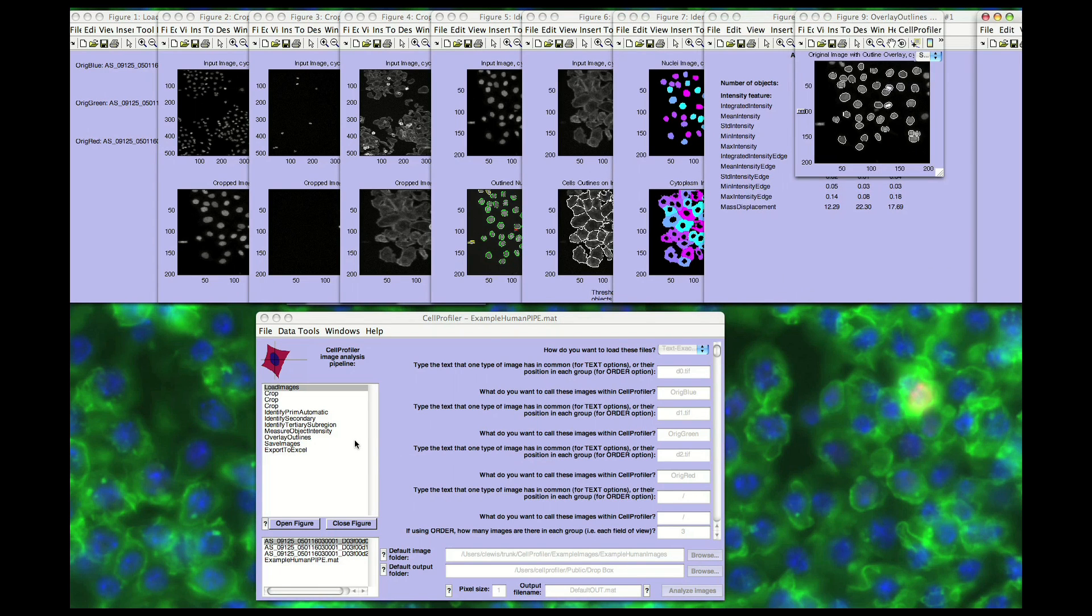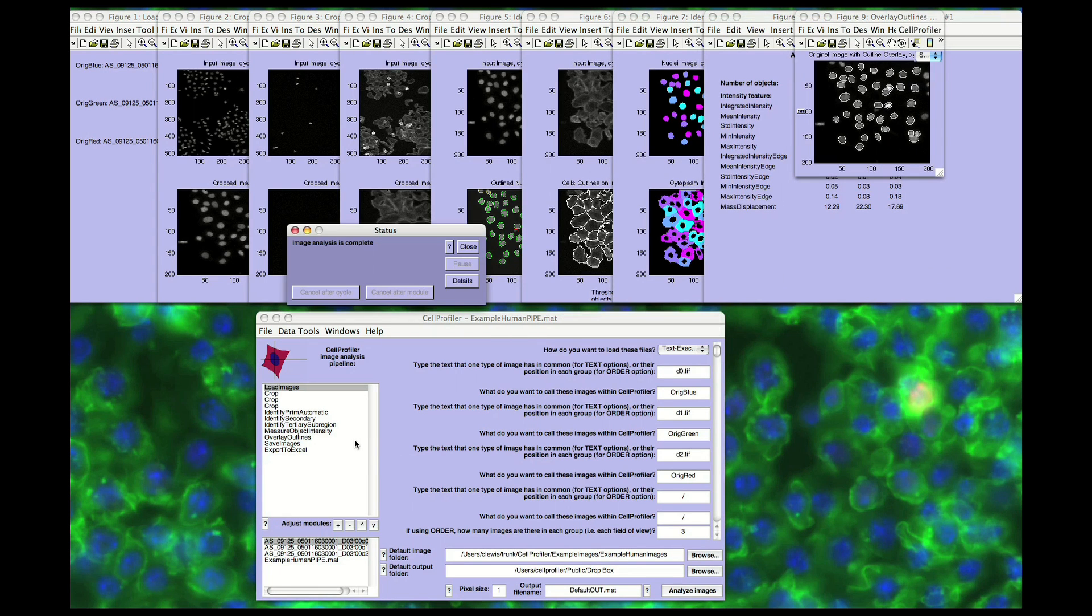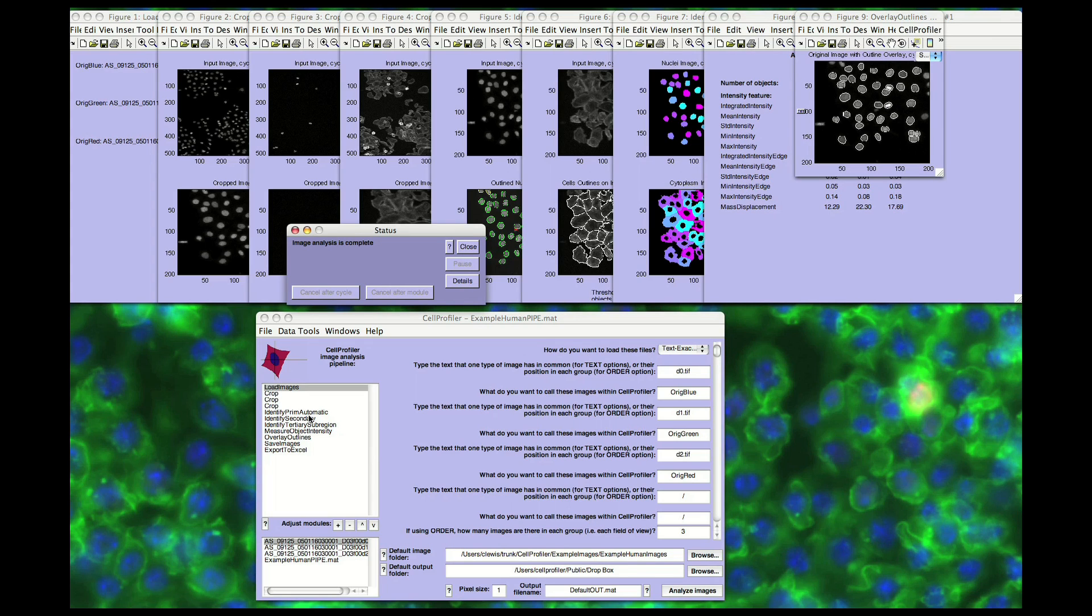Once the pipeline is satisfactory, analysis can be performed on a local computer or automatically divided into smaller batches to be sent to a cluster of computers. Typically, the analysis proceeds first by loading in the image data as input, then processing the image, identifying the objects, and finally measurement.